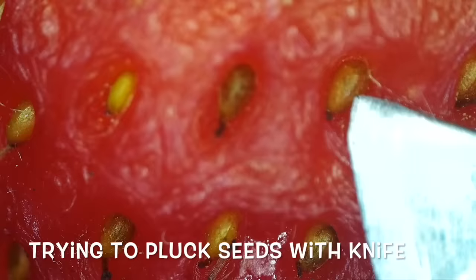Okay, so this right here is a strawberry — pulled it from the fridge, it's been washed. I'm pretty sure it was washed, but I don't know how well it was washed. Do you see it? Do you see what I'm talking about? This is just a normal strawberry, and that is some kind of bug. So disgusting. I am washing my fruit so well now.